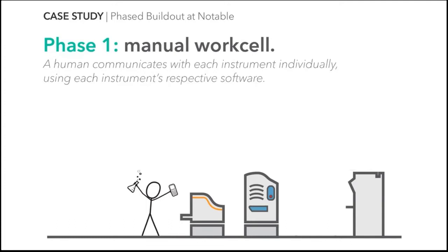And when a scientist is running an assay, they have to individually interact with each instrument. So in this example, they might have to walk over to the incubator, open it up, dig around for their plate, grab it, then they'll walk over to the acoustic dispenser's computer, tell the acoustic dispenser exactly which liquids they want to transfer from which wells at what volumes, manually load their plates, and so on and so forth.